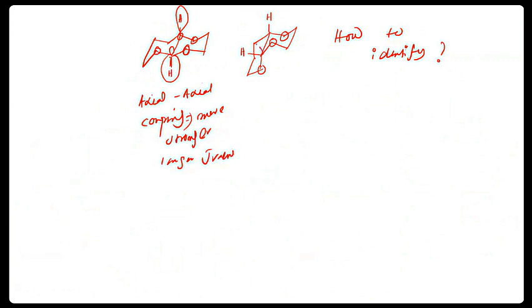Here these two orbitals are not aligned parallelly, so not aligned in parallel. That's why weaker coupling.